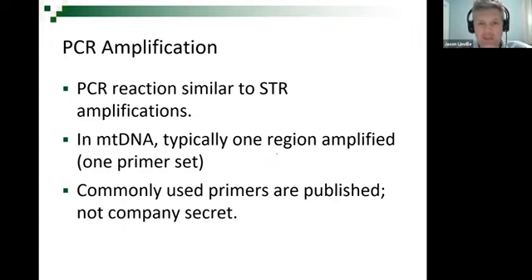Okay, PCR reaction. Like I mentioned before, when you do a DNA extraction, you extract all the nuclear DNA, and when the cells bust open, you extract the mitochondrial DNA as well. So if you're doing STR analysis, 13 pairs of numbers, amplification, squirt, your DNA goes into that tube. For this mitochondrial reaction, it's the same tube. So when we did our extractions earlier this semester, we have your mitochondrial DNA in a tube. Also, we could do an amplification of your mitochondrial DNA as well. You don't need to do a separate extraction. This only occurs at the amplification step.